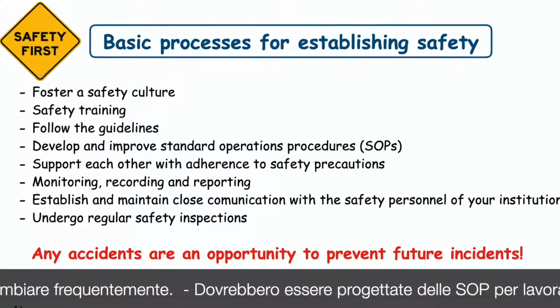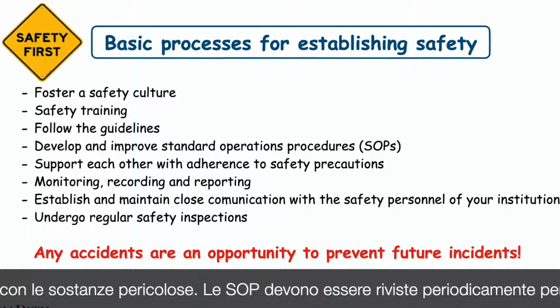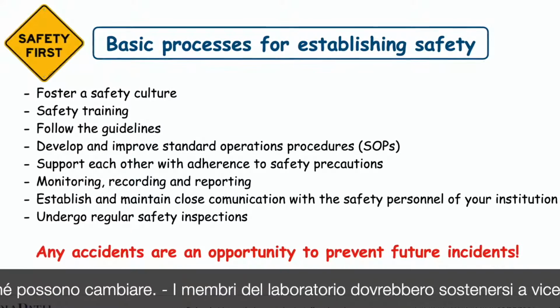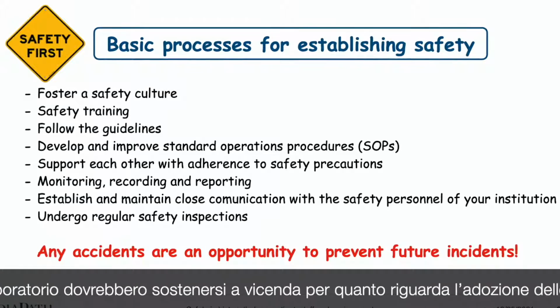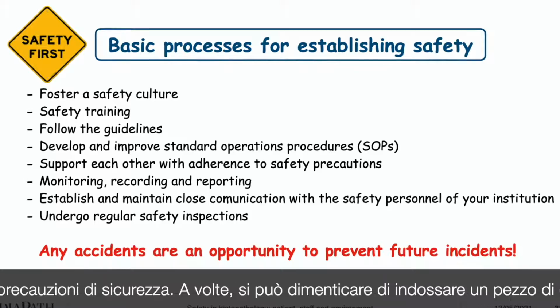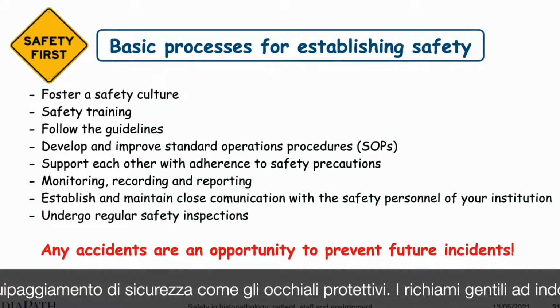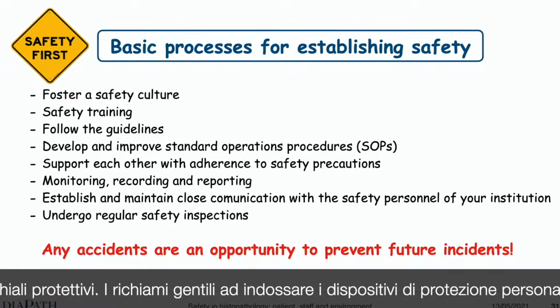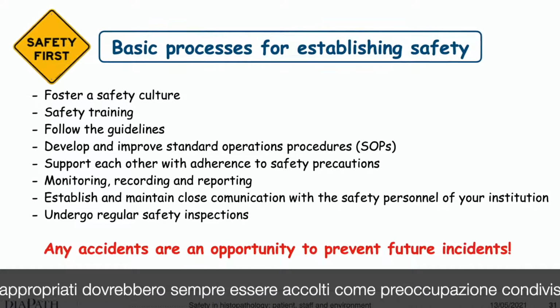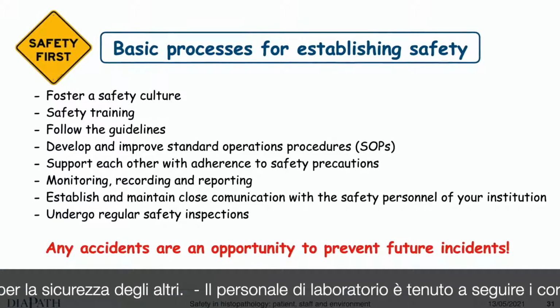SOPs for working with hazards should be designed. SOPs should be reviewed periodically as they may change. The members of the laboratory should support each other regarding safety precautions. On occasion, one might forget to wear a piece of safety equipment such as safety glasses. Gentle reminders to wear appropriate personal protective equipment should always be welcomed as shared concern for each other's safety.